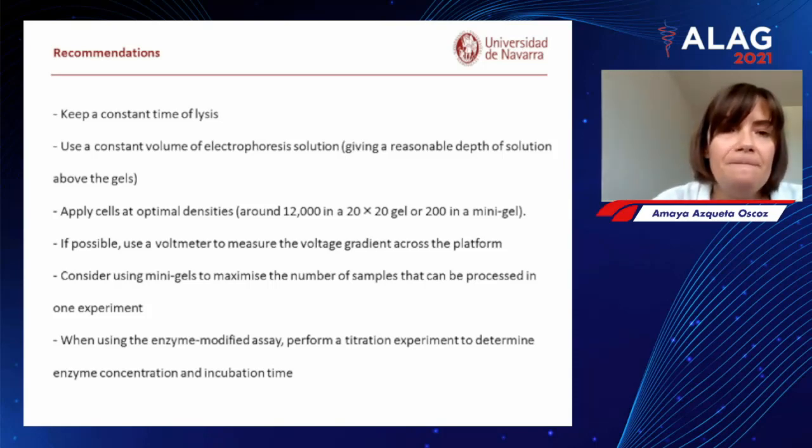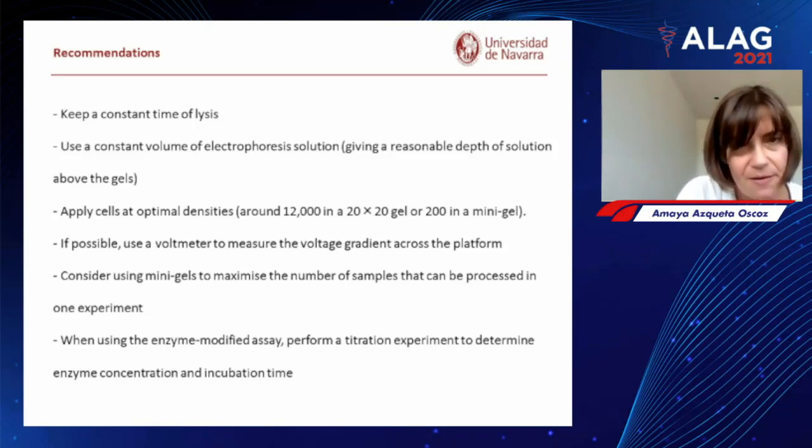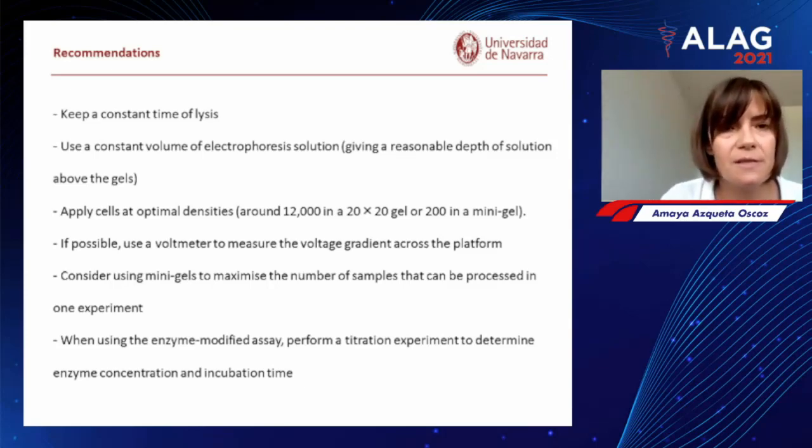And sometimes when you have a set of experiments, you realize that you have used 1 hour in some of the experiments, overnight in some others, 24 hours in others, 4 hours in others because you went for lunch or wherever. So this will increase a lot the variability, the intra-laboratory variability. So keep a constant time of lysis. Choose one and keep it.